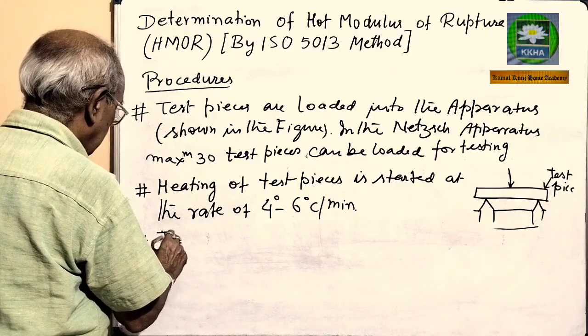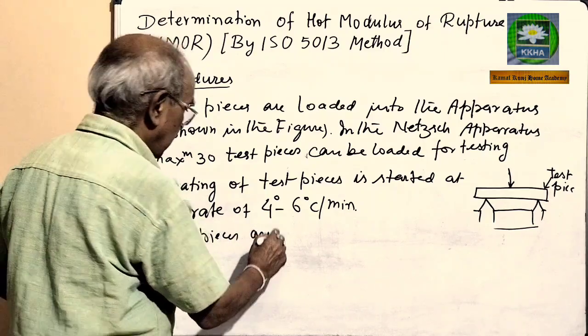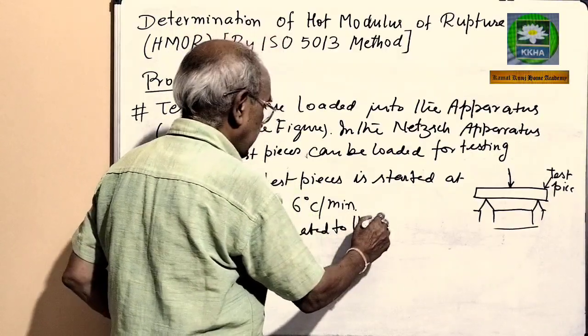Now, test pieces are heated to the test temperature.